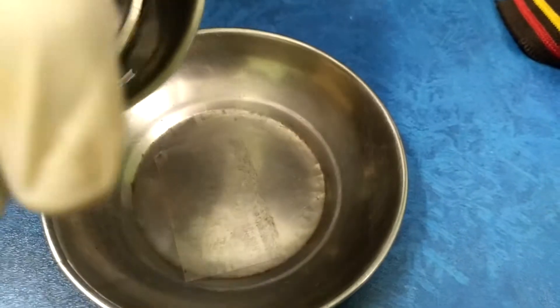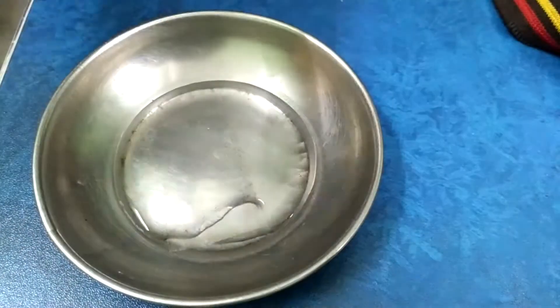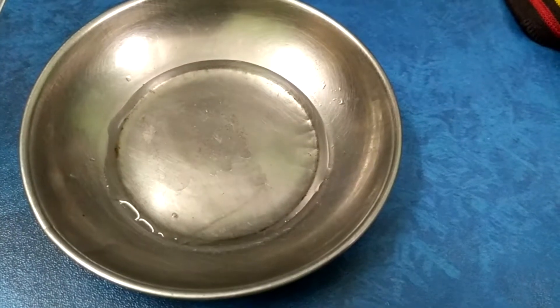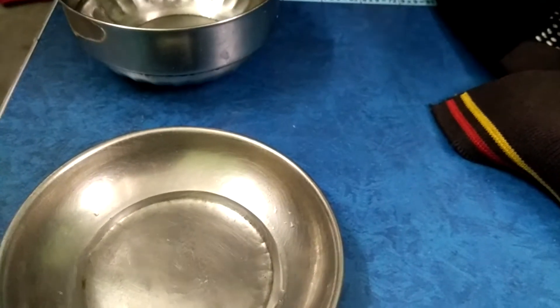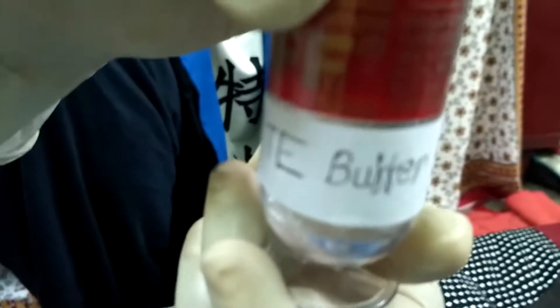Now, we will put some water here. We have to use a special type of chemical to dissolve that DNA into that solution. This is known as TE-buffer. Here, I am putting a few drops of TE-buffer into that solution.